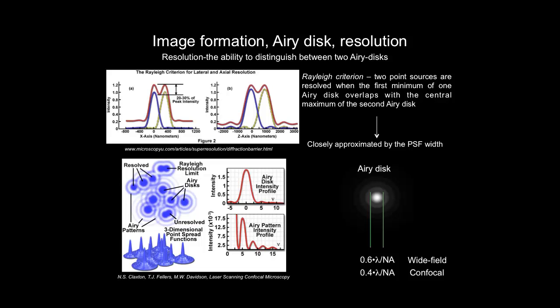This resolution is directly proportional to the wavelength, and inversely proportional to the numerical aperture. So that shows us that you get better resolution with shorter wavelength.